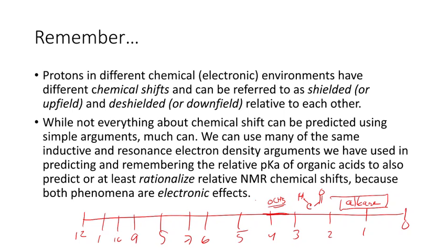and it gets further and further down here, especially if it's an OCH3 or an OCH, if it's got a carbonyl group attached to it. We'll see later that the 5 to 6 range is where hydrogens on carbons with double bonds to other carbons show up. And this region, 7 to 8, very important region, the aromatic, with the really shielded ones to the right of 7, the really deshielded ones to the left of 8, giving us a clue as to what is on this aromatic ring.